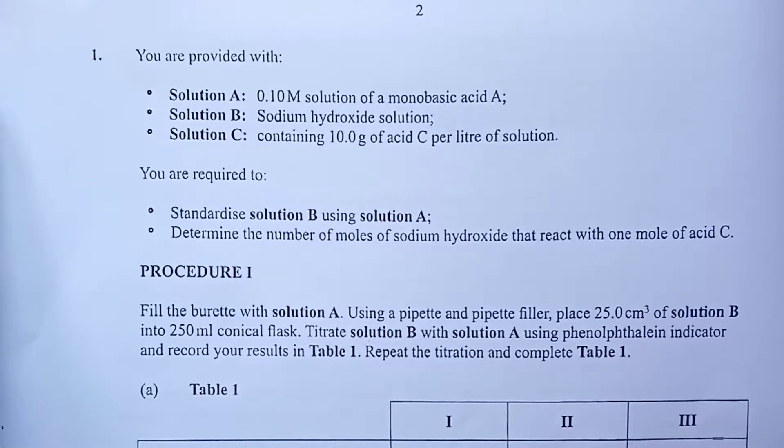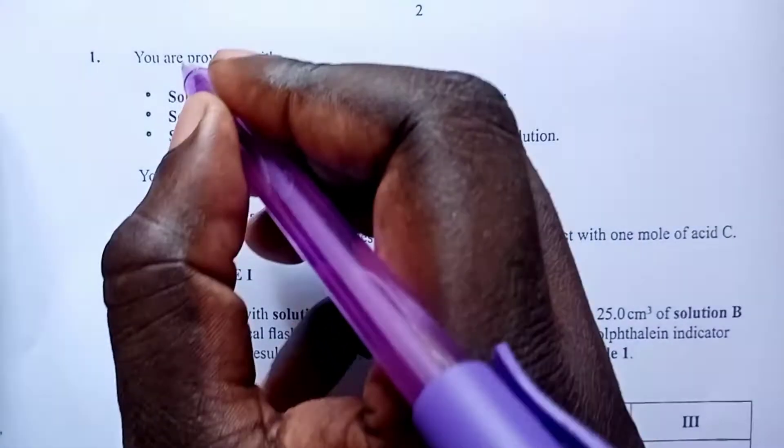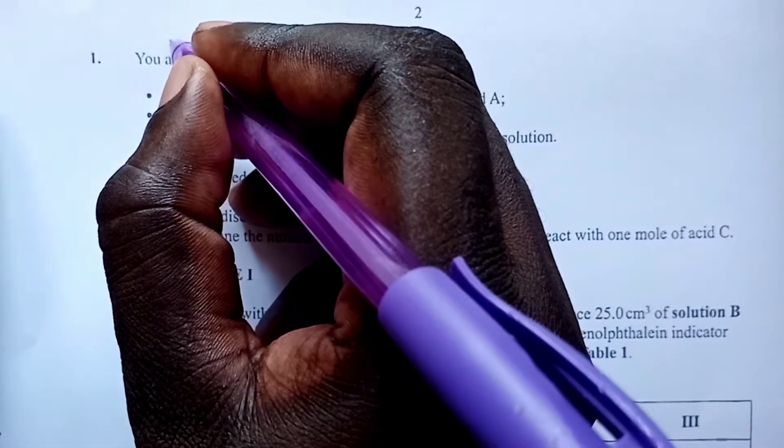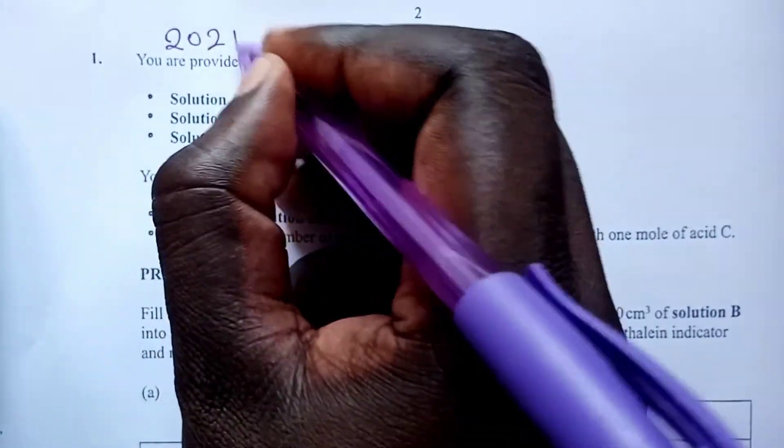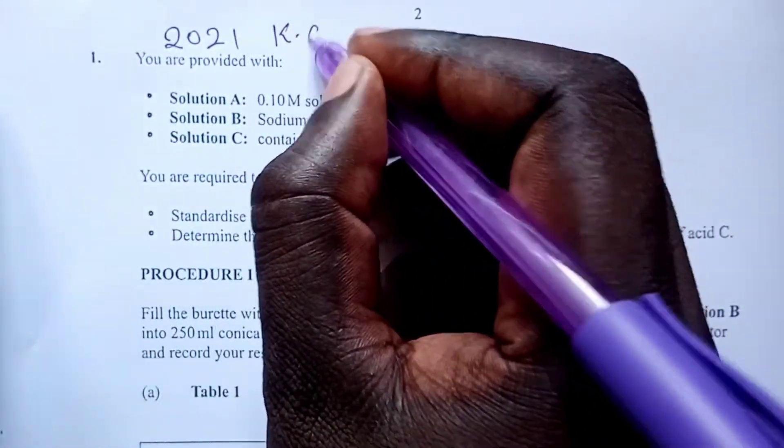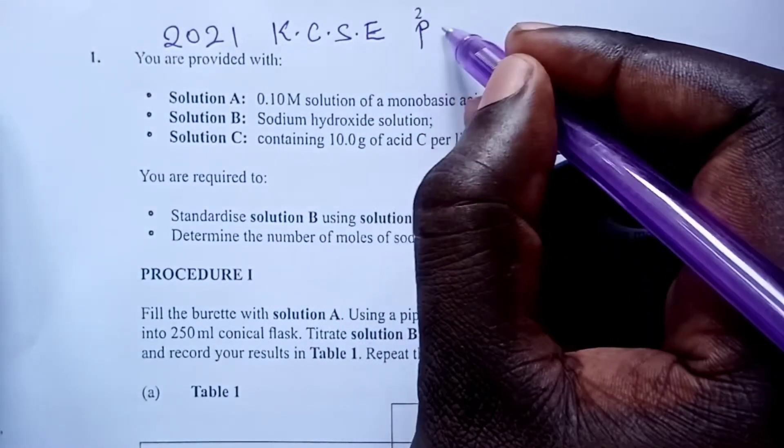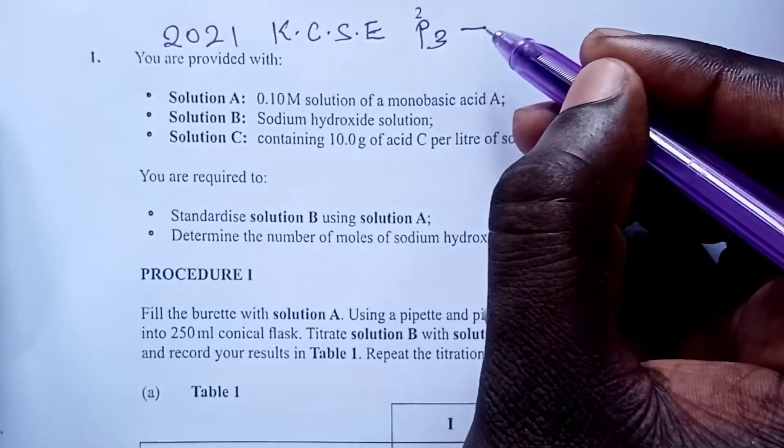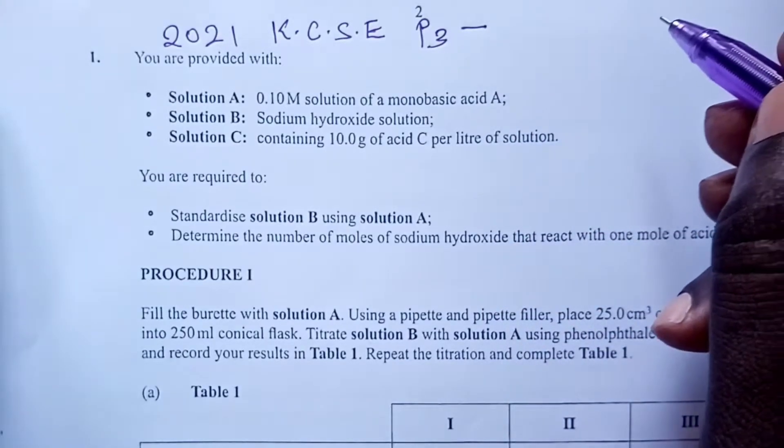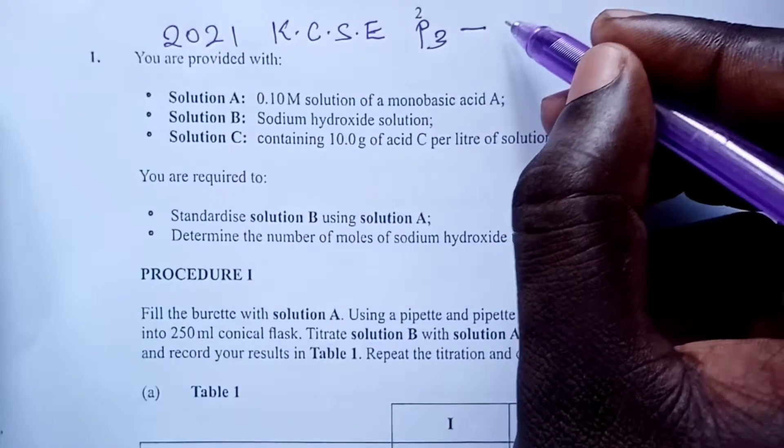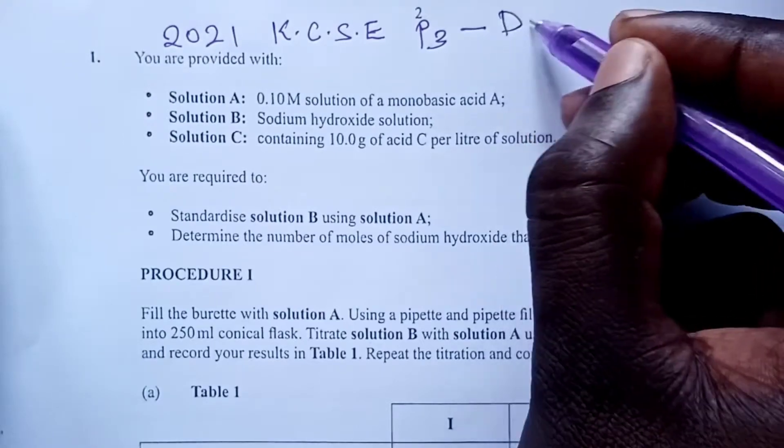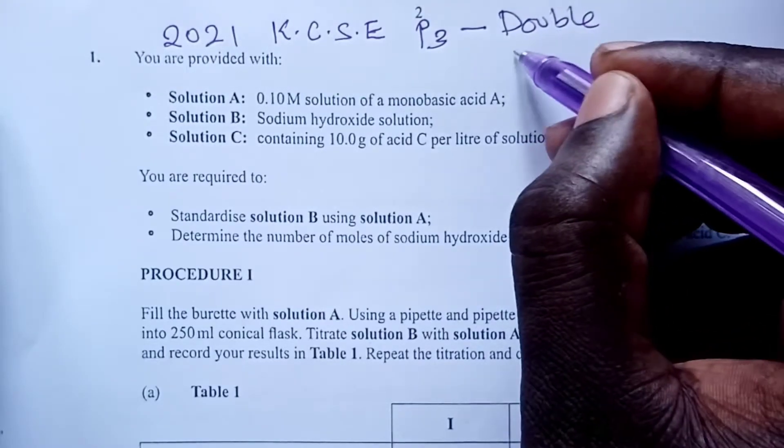Greetings once again from us and welcome. We have the pleasure to present 2021 KCSE Chemistry Paper 3. This year, question 1 tested what we call double titration.